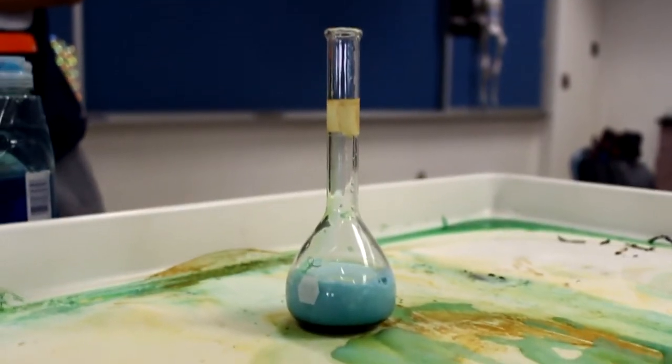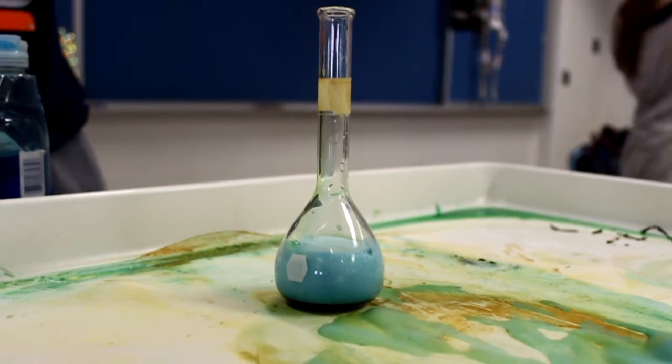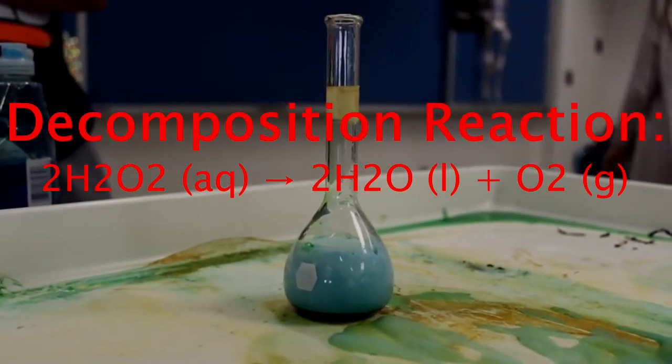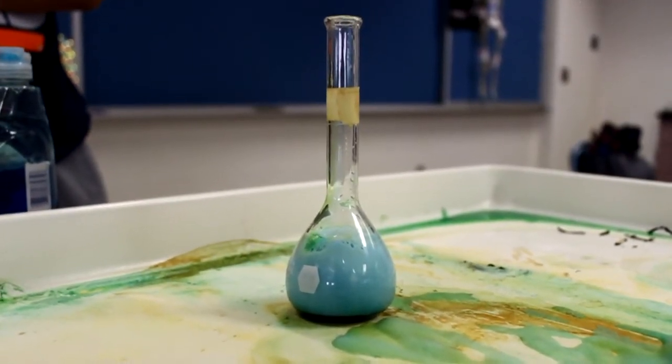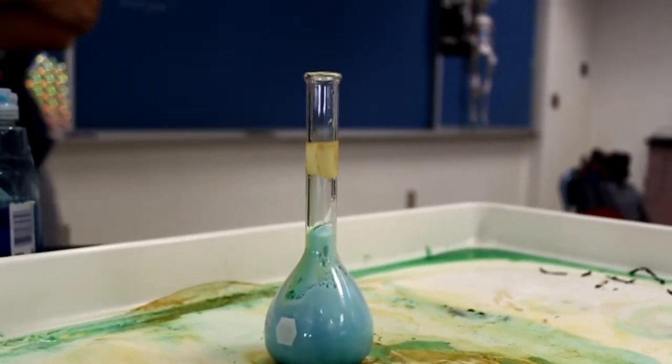So our experiment that we're going to be showing you today involves the decomposition of hydrogen peroxide, also known as H2O2. That breaks down into water, H2O, as well as oxygen gas, O2. This decomposition happens very slowly in nature, regularly, but if you put in a catalyst, you can speed it up.